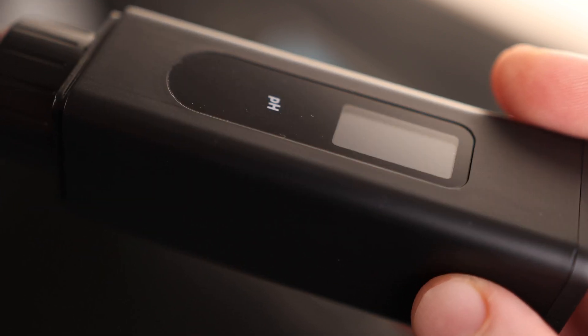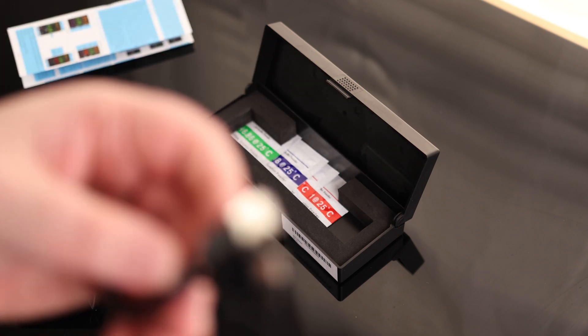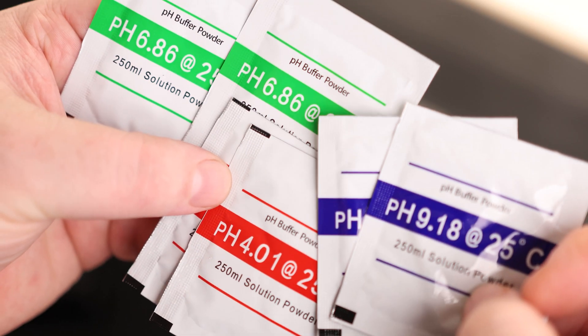On the top we got a power button. We got a USB-C charging port, and then we got our display on the side. We have our instructions, a charging cable — it's USB-A to USB-C — and we have our sample powders. You can see we got a pH 9.18, a 4.01, and a 6.86.